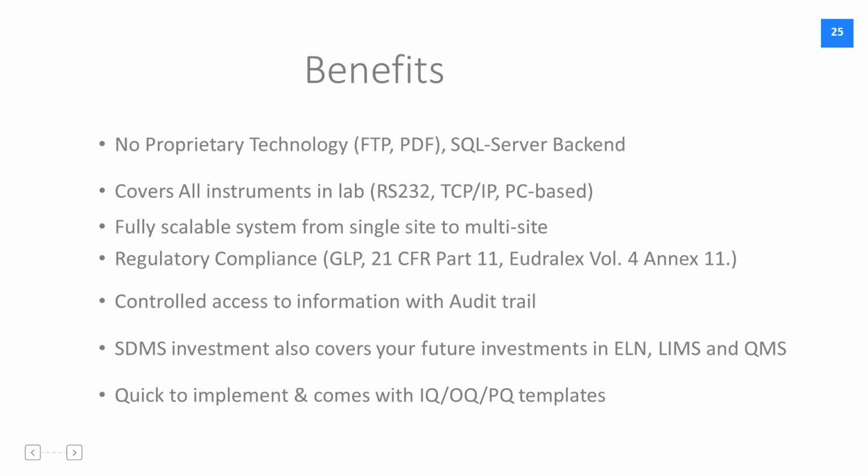LogiLab SDMS does not use any proprietary technology. The technologies that we use are very standard and they are industrial standard technologies like FTP, PDF, SQL Server database backend. All of them are non-proprietary systems. LogiLab SDMS covers your entire laboratory. That means all types of instruments, including standalone instruments and PC-based instruments and database-oriented instruments.